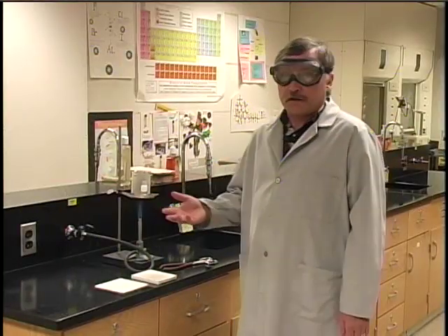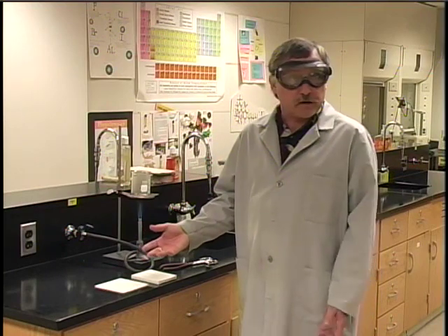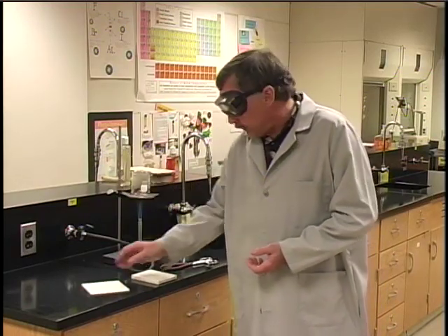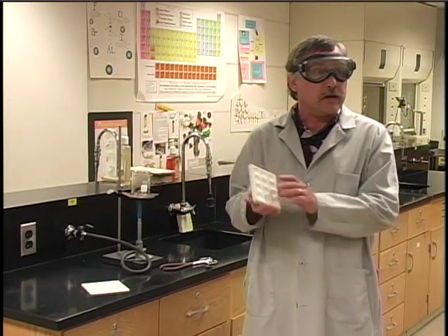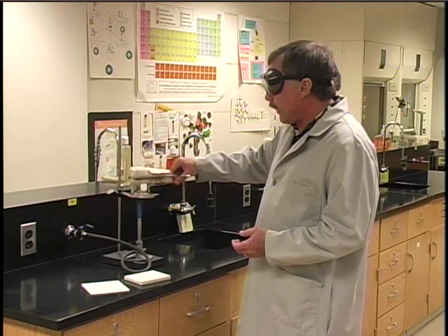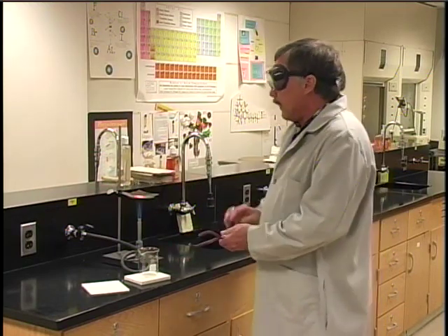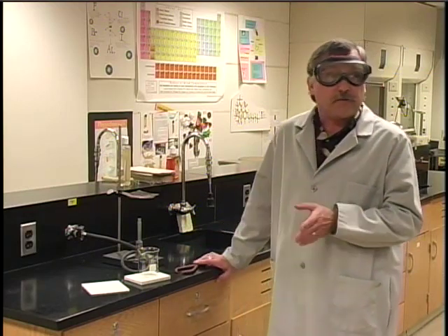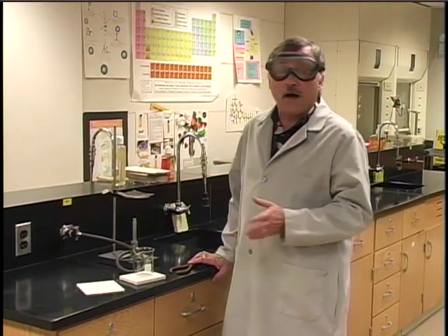When you need to set a hot object down on the countertop, you need to protect the countertop. We have a couple of things in your lab station for this in the top drawers: one is a ceramic pad, and the other is a spot plate whose back can also be used — either one is okay for hot objects. If you need to weigh an object that you've heated, you have to wait until it cools to room temperature, which usually takes at least 10 to 15 minutes. We never weigh hot objects on the balance, even with protection.